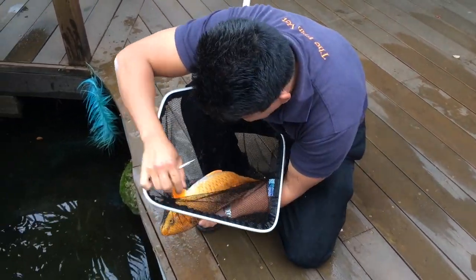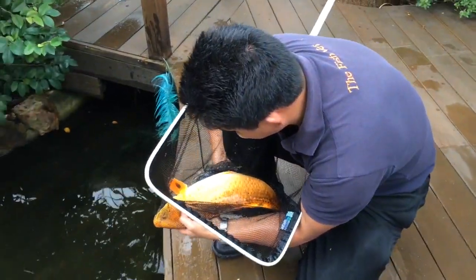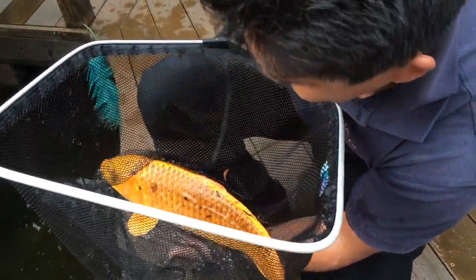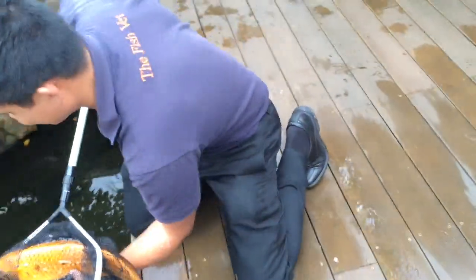Now I'm just going to take a gill biopsy — you can see it coming through here, holding the operculum open. And now I'm just taking a skin mucous scrape, because parasites tend to like to live on the skin as well as on the gills. So we're taking two samples.